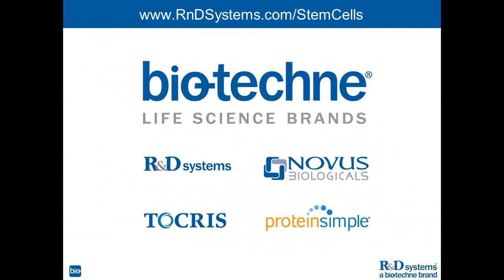Another similar question was about the differentiation of stem cells into retinal cells or inner ear by using various different molecules to stimulate the differentiation. Yes, and we have played around with that a little bit. We aren't really close to a kit, but we have been able to get some early otic differentiation.